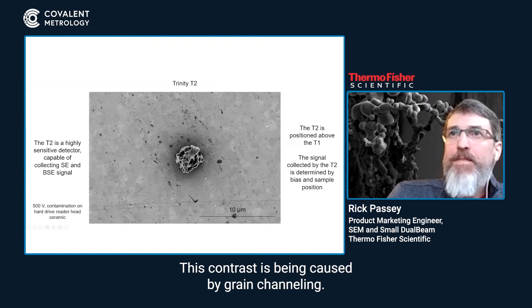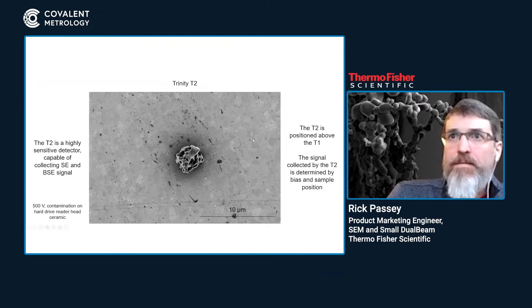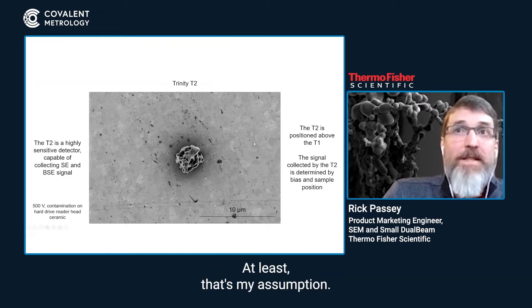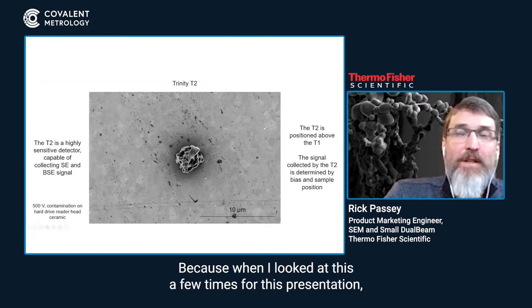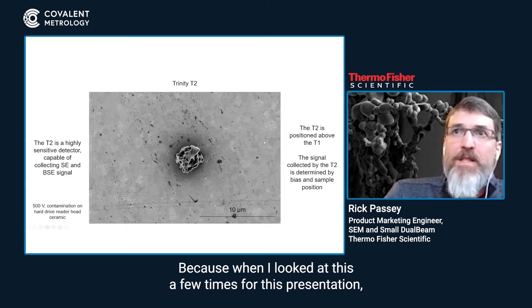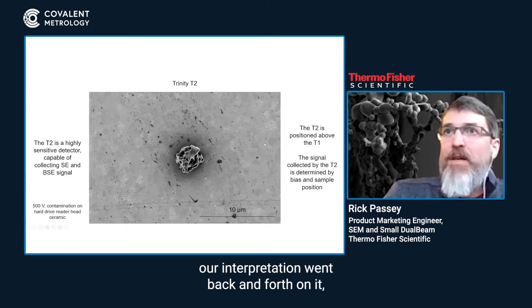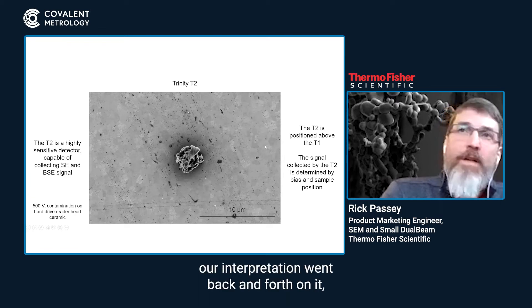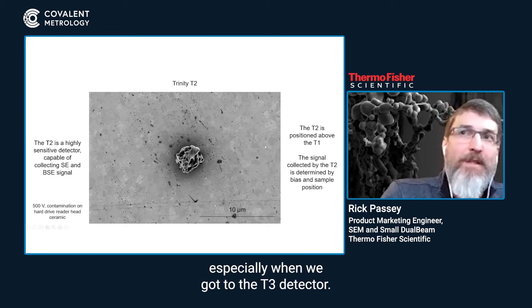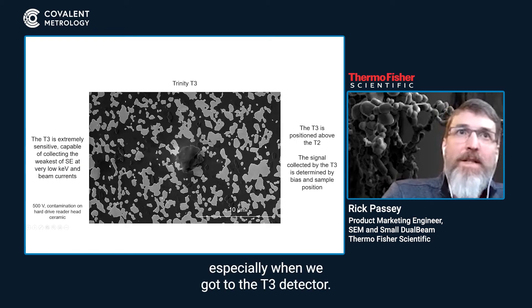This contrast is being caused by grain channeling — at least that's my assumption — because when I looked at this a few times for this presentation, the interpretation kind of went back and forth, especially when we got to the T3 detector.